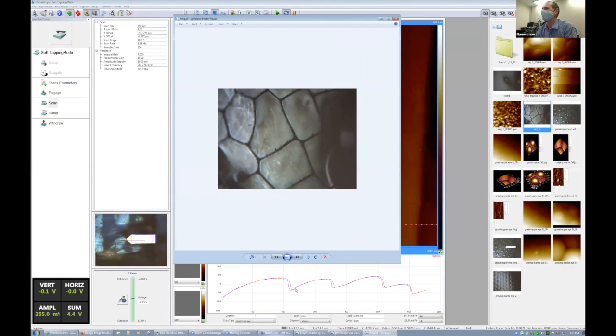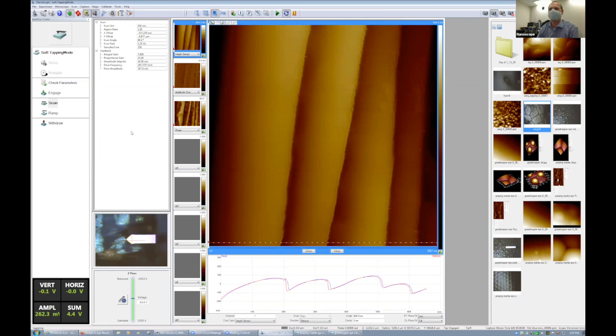I think this one was some kind of a fly that we're trying to look at. Oh, Amrit wants to know, have you done a snake? I have not done a snake, no. Not yet. If you send us a sample, we can try. One of the weirdest things I've done was chocolate. How did the chocolate look? It just looked like a polymer, essentially. A smooth surface with little grains in it. Probably grains of chocolate and little bubbles, because sometimes the chocolate's aerated. Maybe, I don't know.